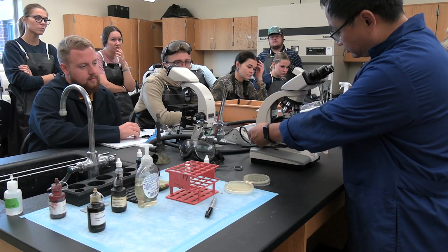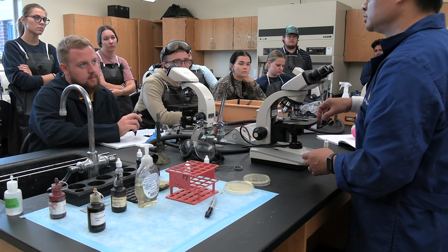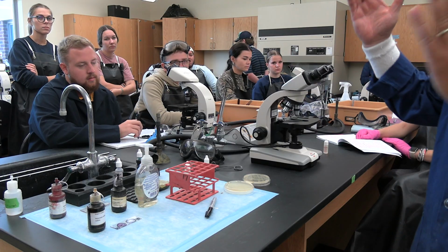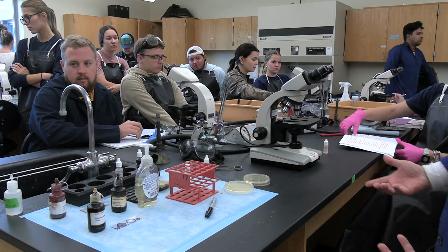Same thing. We have another thing we're going to do, which is the endospore stain, where you're going to use Bacillus on Thursday. So I'll keep this one here. Everybody do it individually. You can pick a new one, but I encourage you to use the older one in your box and use the same procedure to do the gram stain.